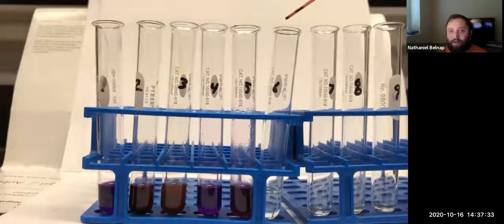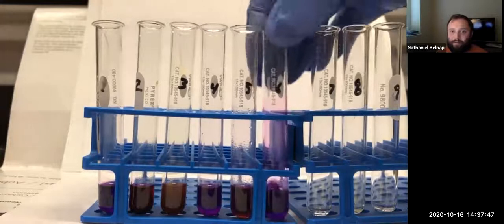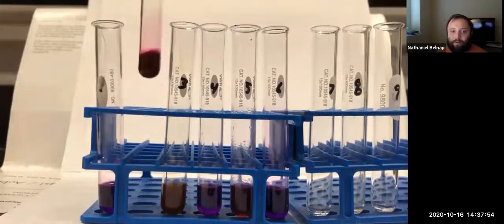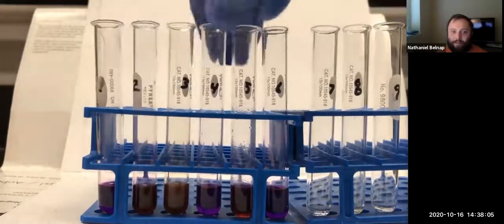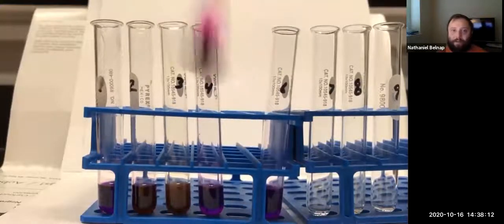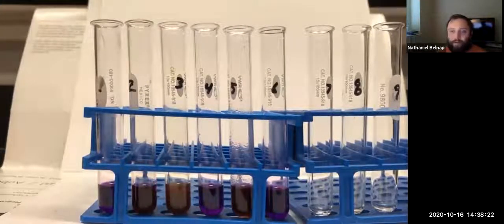I believe he's adding the compound, and then the acetone, and then the potassium permanganate. That one still looks just like number 1, your control. So I would say number 2, number 3, and especially number 3. Obviously number 4 still looks very, very purple, right? Number 5, I would say, is unsaturated, not quite as deep as number 3, but number 6 I would definitely say is saturated. So negative.